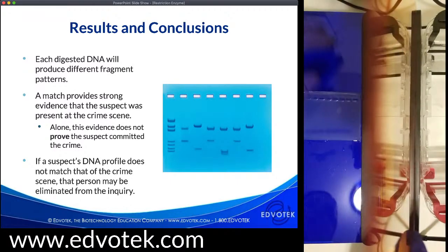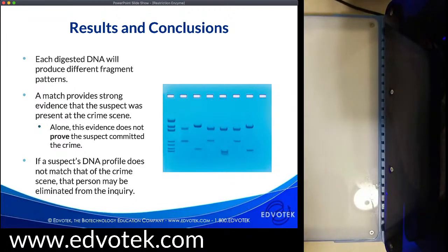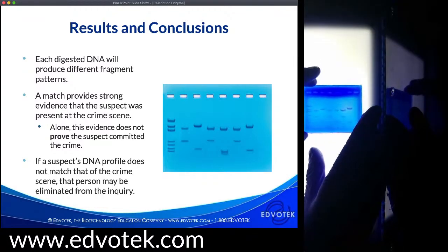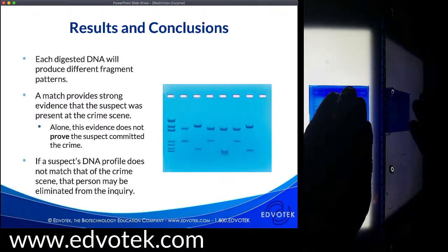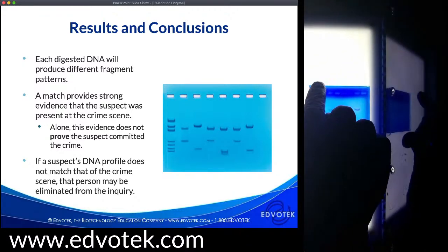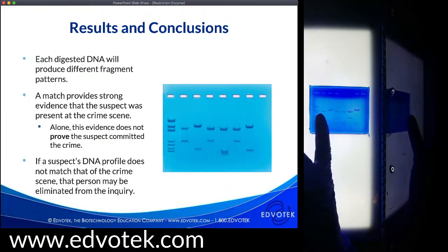Let me bring the other gel in. The nice thing about the True Blue 2 is that it has the white light feature as well. Now using the white light feature, we can see the Flash Blue-stained gel has dark blue bands on a lighter blue background, and we see that same banding pattern as before. This gel actually ran better — part of the reason some of those bands were a little fuzzy was because I didn't get all the sample in the wells, but you could still see a really strong signal. Here is our crime scene DNA, suspect one, suspect two, and that suspect two DNA profile matches up where suspect one doesn't — and the banding patterns are different between people.